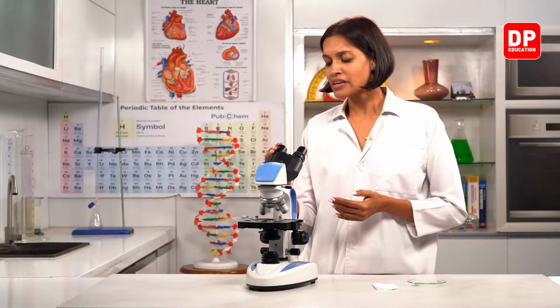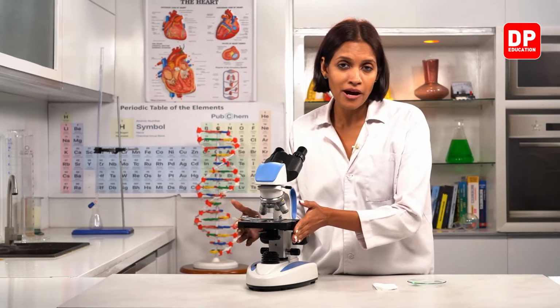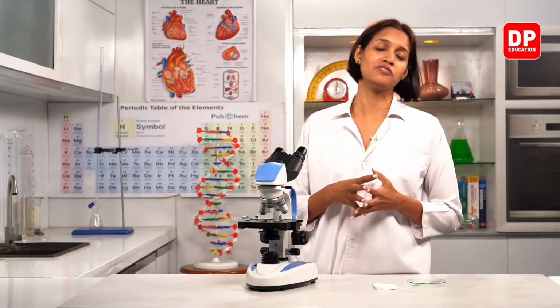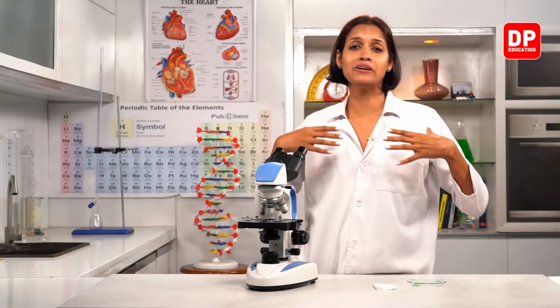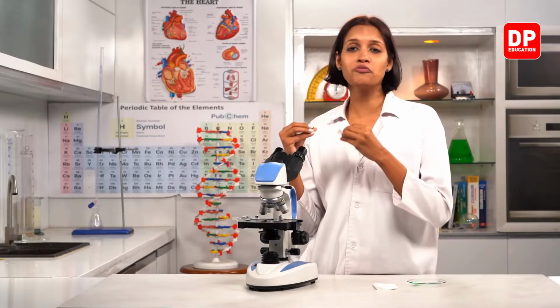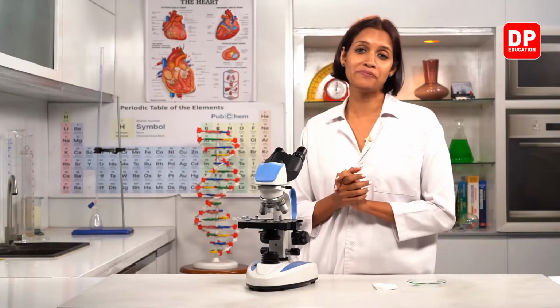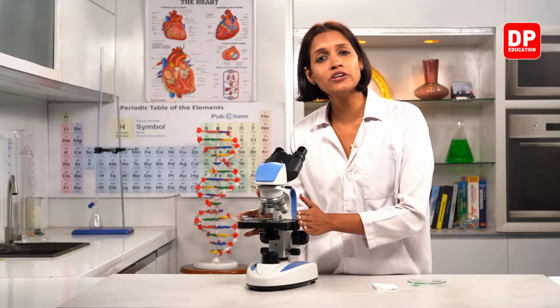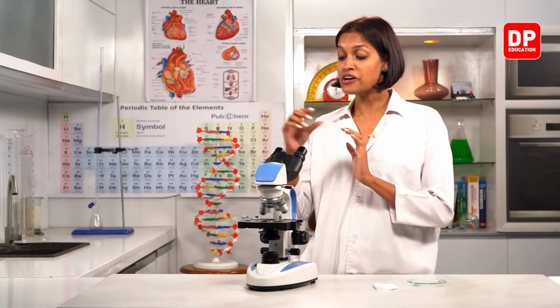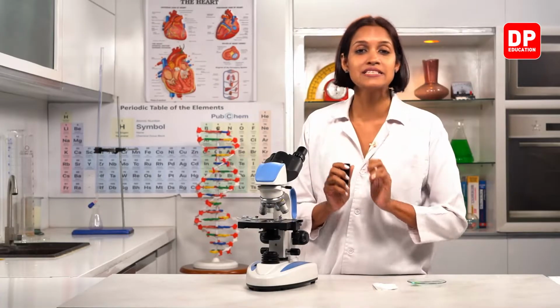Right, children? And the other thing, what are the most important parts of the microscope? The lenses, right? And lenses always get affected by fungus, because in the environment there is always moisture, there is water vapor, right? When a lot of moisture is present, fungus can grow very well in those places, right? So if we are not going to use the microscope for a long period of time, what do we have to do? We need to remove these lenses. All these lenses can be removed.